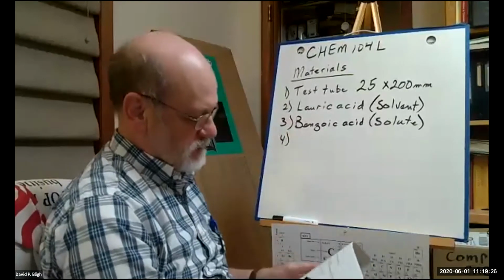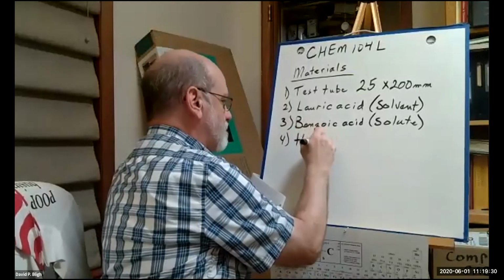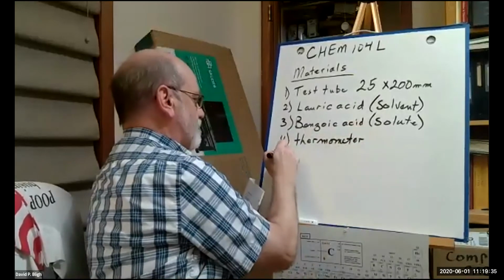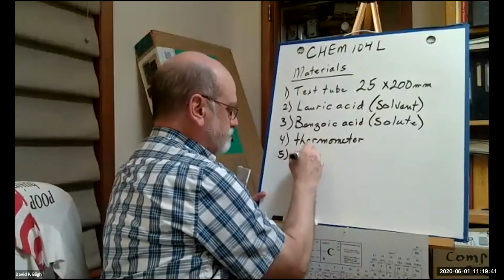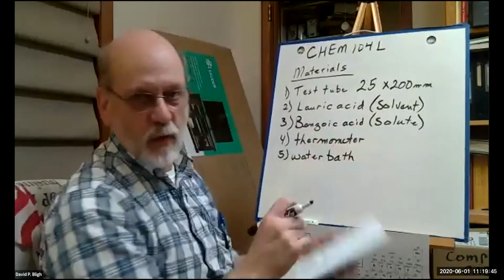Then we need a thermometer. All right. We need a water bath. How are we going to make our water bath?